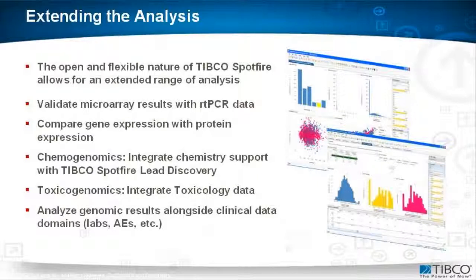TIBCO Spotfire is a very open platform, allowing incorporation of many different types of data, making for a rich analysis experience.